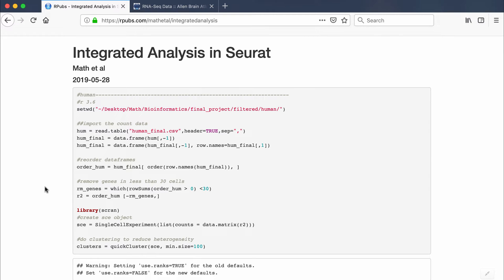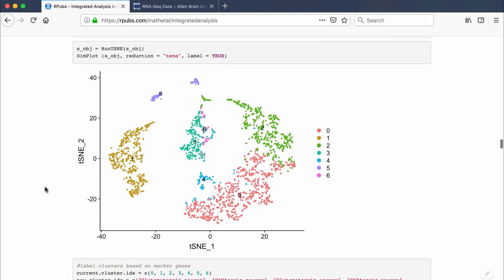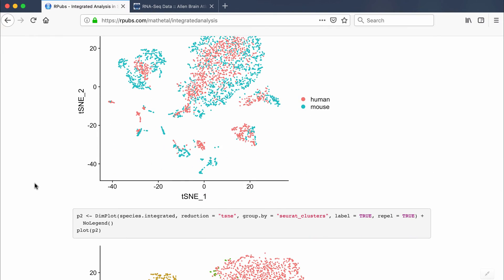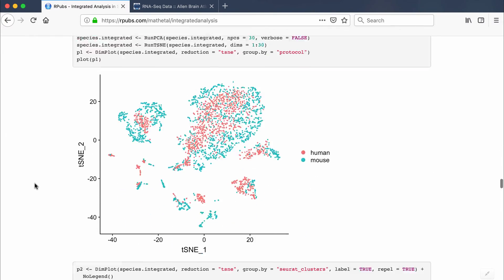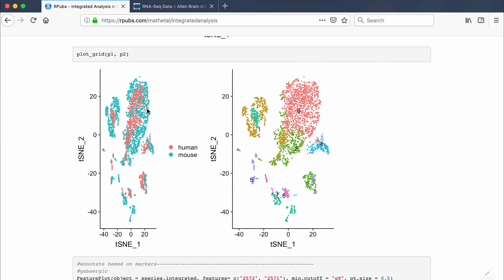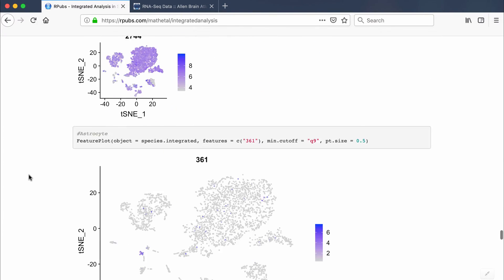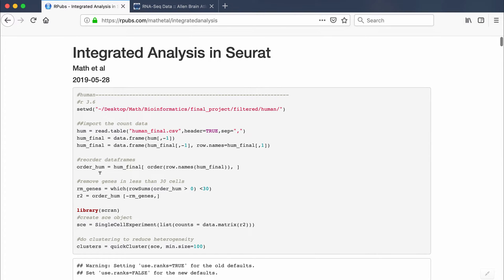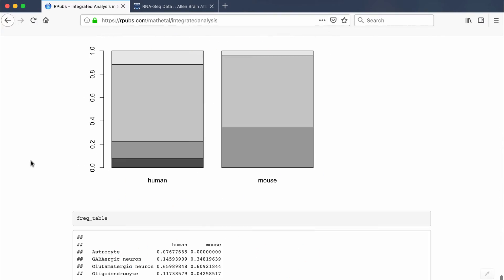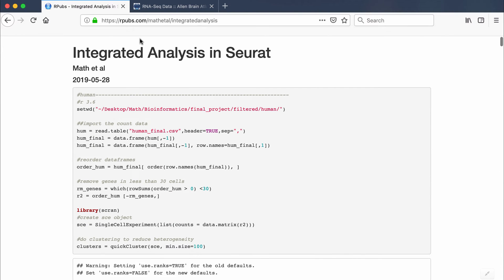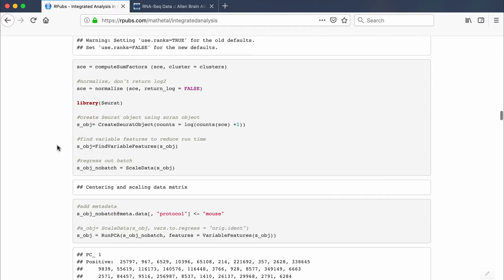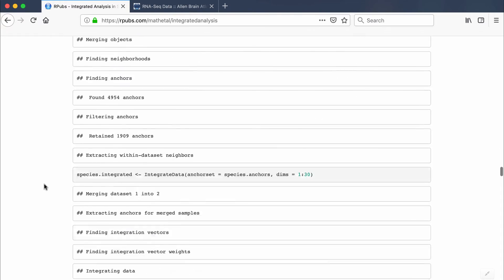In this video I'm going to do another single-cell RNA-seq tutorial similar to my last video, which covered cell type labeling. This video is on how to do integrated analysis in Seurat. I've already published the code to RPubs so it's publicly available, and the video will go over the RPubs documentation since it already has all the graphs and everything printed out.